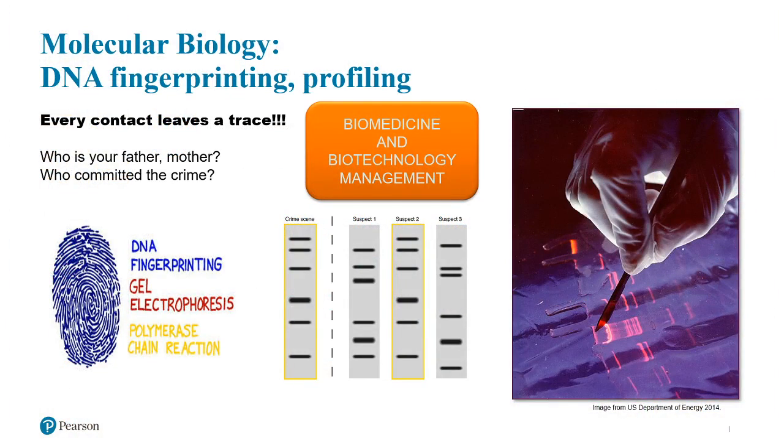DNA profiling or DNA fingerprinting is used to solve crimes, in medical diagnostics, and to confirm relationships like paternity. Genetically, we are 99.5% similar to each other. However, DNA fingerprinting is a modern technology that analyzes that remaining 0.5% difference from the non-coding regions of each individual's DNA. It uses samples from skin cells, blood, saliva, hair root, or even bone, and it amplifies the samples through polymerase chain reaction and runs them on agarose gel electrophoresis for analysis.